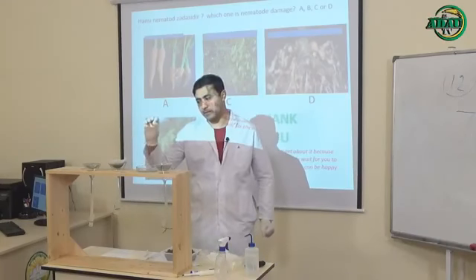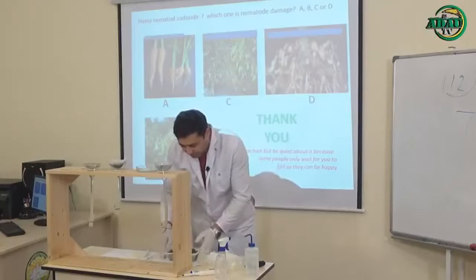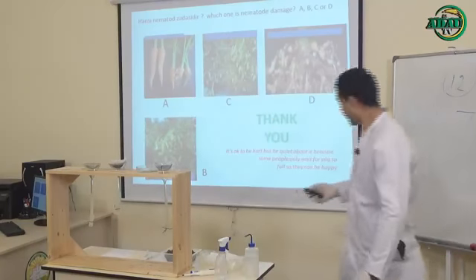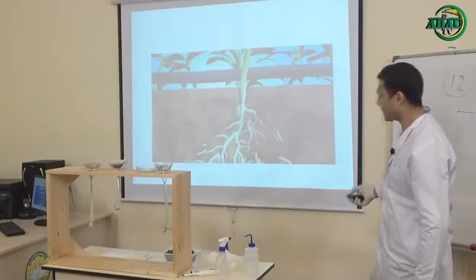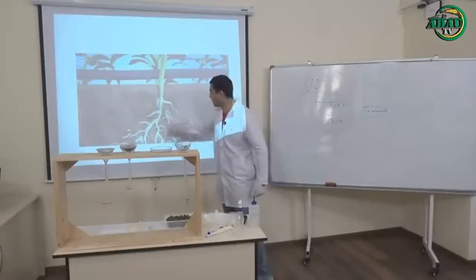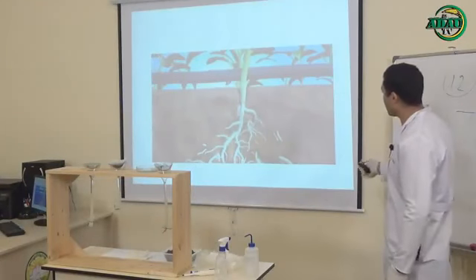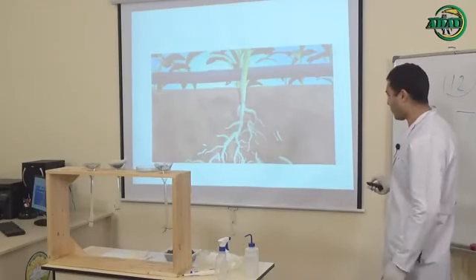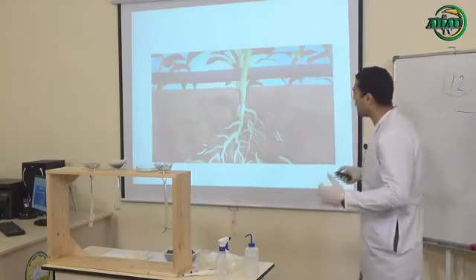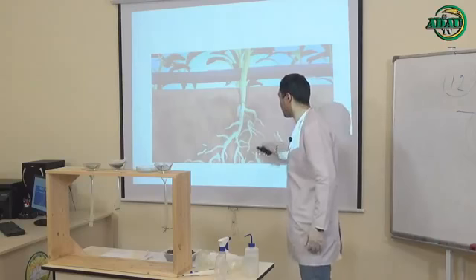Don't take this soil and throw it out somewhere. I will try to explain these parts again, because if your plants are somewhere here, you do not need to take soil far from the plants. You have to take care about this point, the taking of the sample. Most nematodes live near the root site. Actually, they come and enter inside the roots.